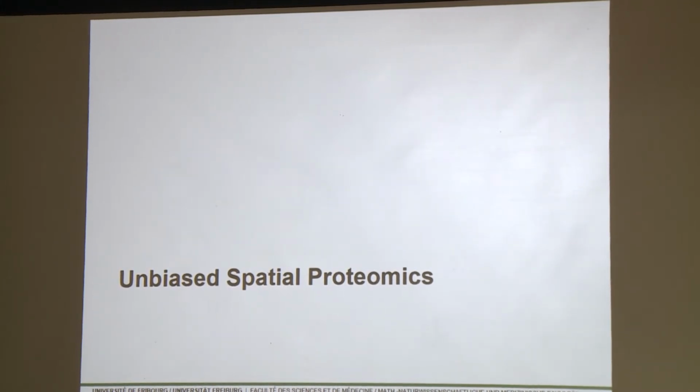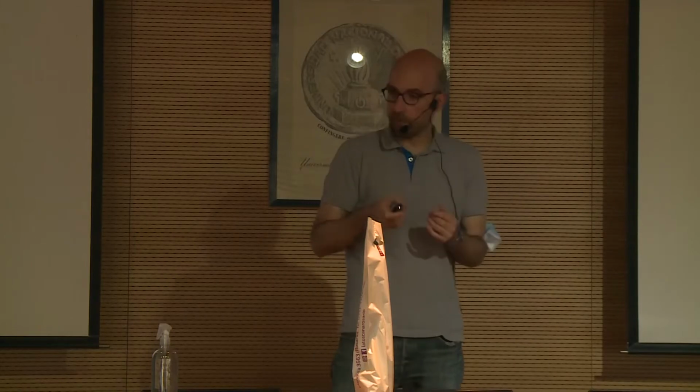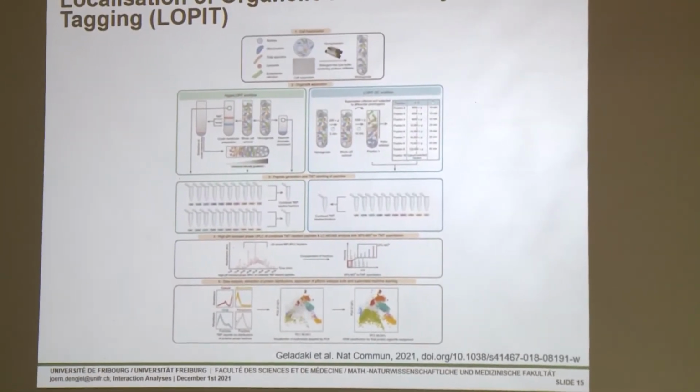In this example, we did this specifically for the autophagosome, but there are many groups that do this on a cell level to get basically an organelle map of the entire cell. And I would like to show you some data which was not from our group, but from the group of Catherine Lilly in Cambridge, I think she works.